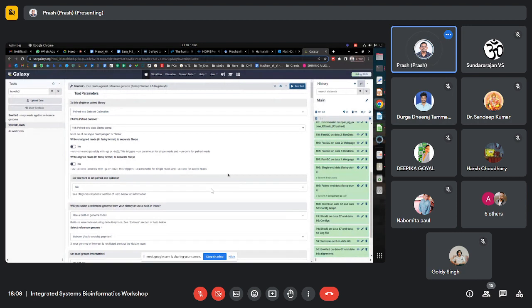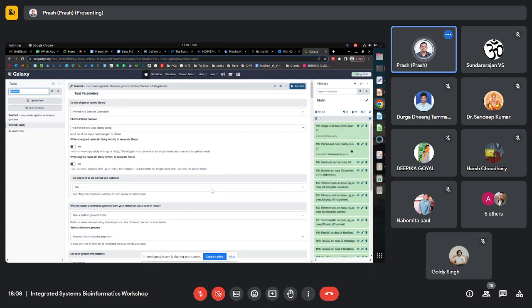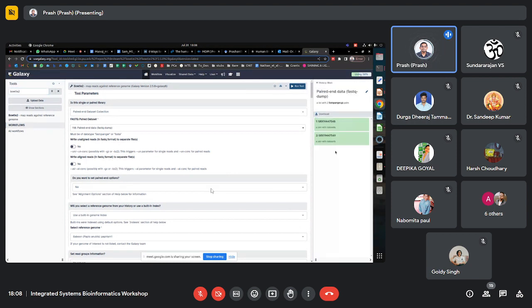That's how it is. So coming to RNA-seq data. For RNA-seq also, we have paired-end data sets, two different data sets. This one is a control, if you remember, SRX19447548, which I got from Get Data, and the other one is the treated one. So instead of Bowtie2, what is the tool that we need to use for alignment for RNA-seq? Can someone tell me? What is the tool?